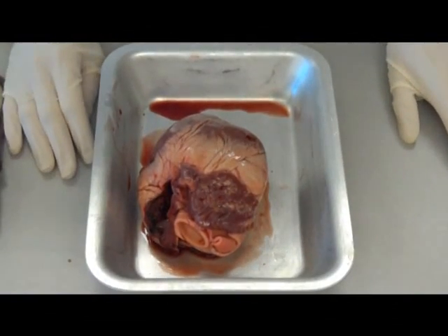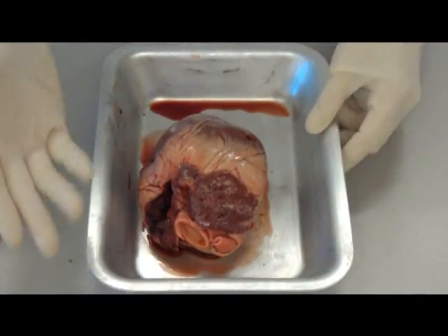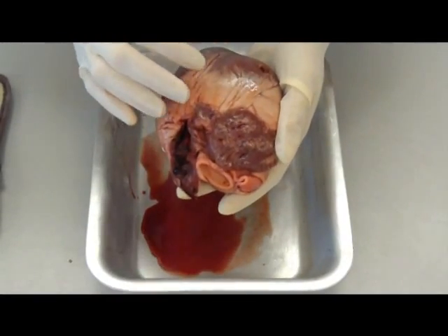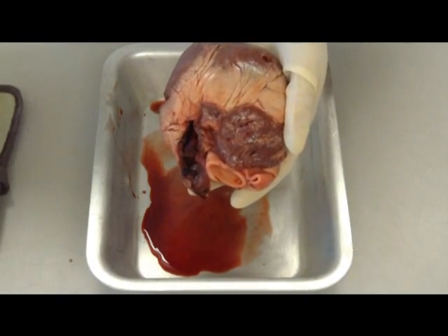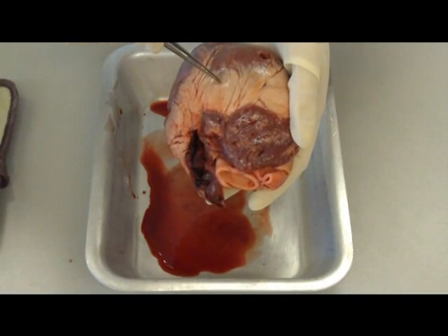Before we actually start cutting the heart open, let's have a look at some of its structures. On the outside of the heart, we've actually got a membrane called the pericardium, which we may be able to identify using the tweezers. But it's a very thin membrane to protect the heart, so it's quite difficult to actually identify.